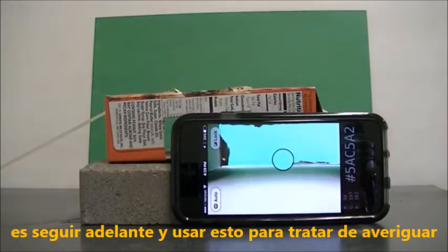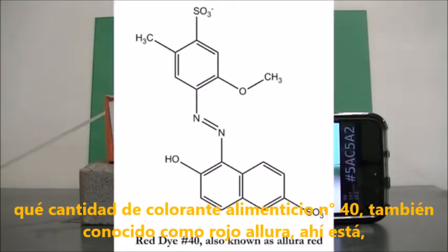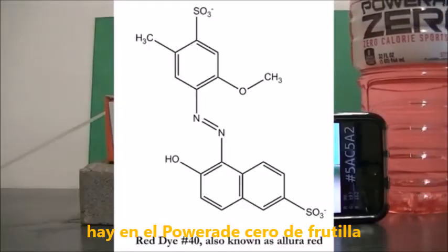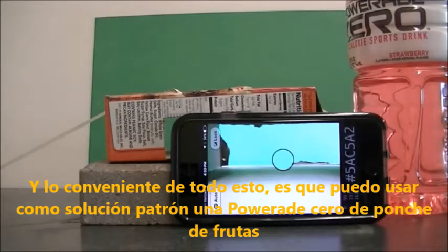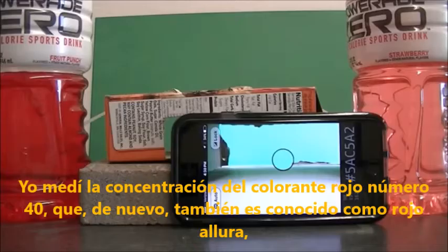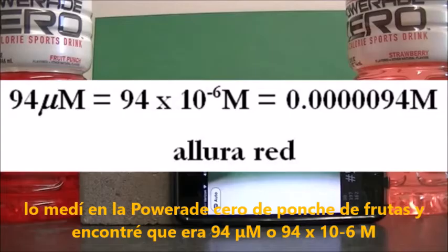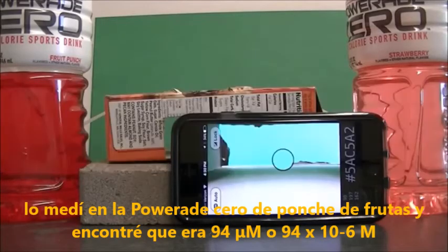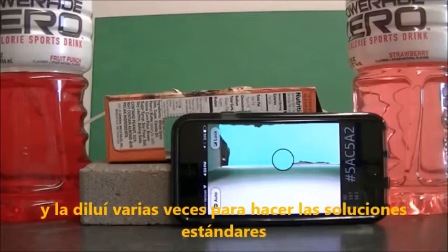Now we're going to use this to figure out how much red food dye number 40, also known as Allura Red, is in Strawberry Powerade Zero. As a stock solution I'm using Fruit Punch Powerade Zero, which I've measured to contain 94 micromolar (94 × 10⁻⁶ M) red dye number 40. I've diluted it to various extents to make my standard solutions.